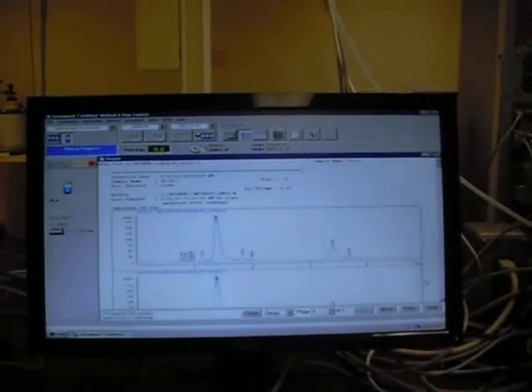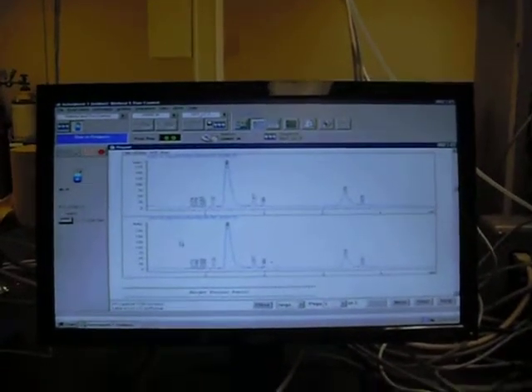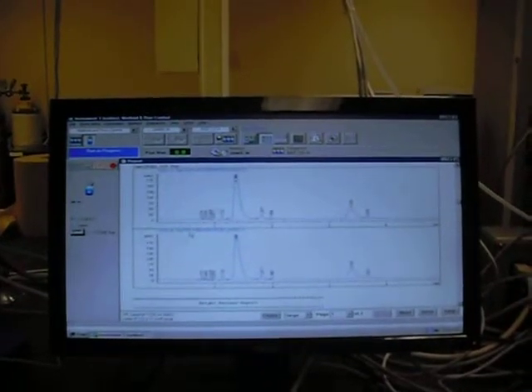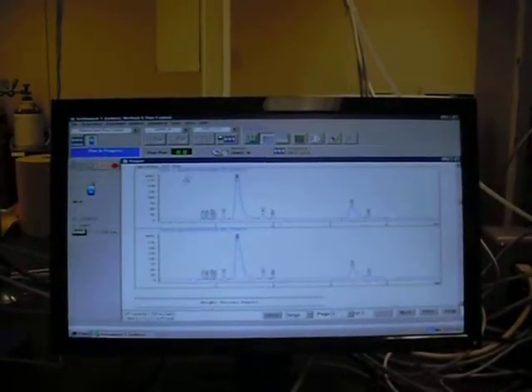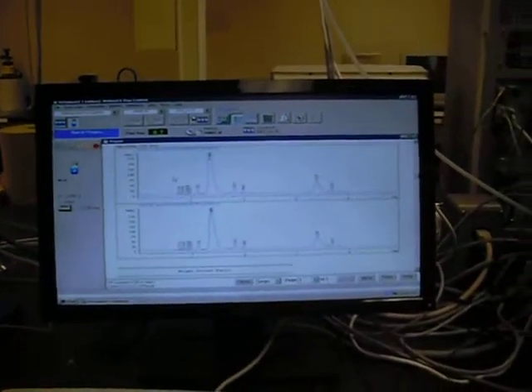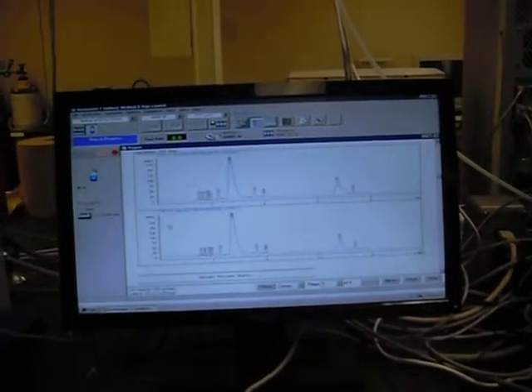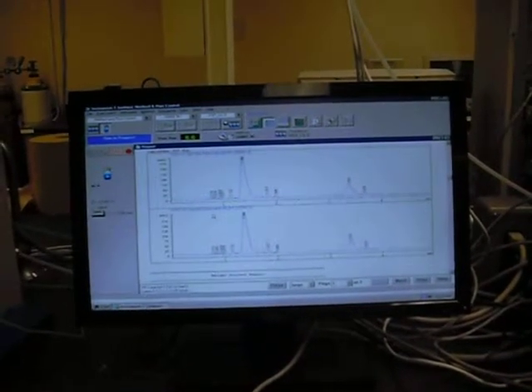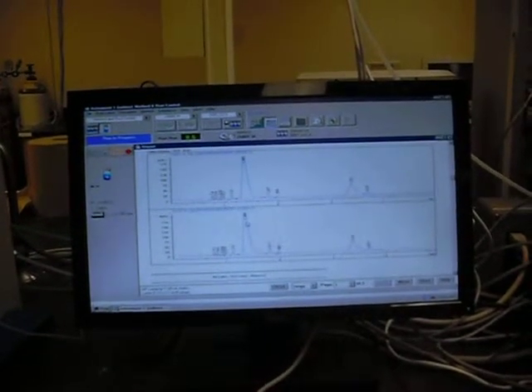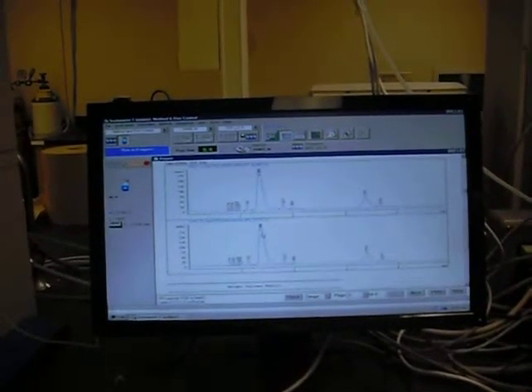And then if we scroll down here a bit, we see there's a second chromatogram that was recorded at 255 nanometers. And there's really no point in collecting two chromatograms at such insignificantly different wavelengths, but you can generate greater sensitivity in one chromatogram than the other to a particular analyte by choosing the wavelengths. So you could generate a whole bunch of different chromatograms because you have a whole bunch of different collection wavelengths that you could look at.